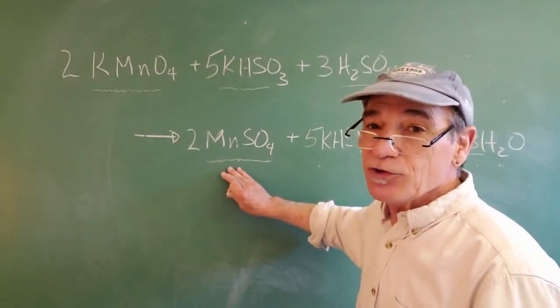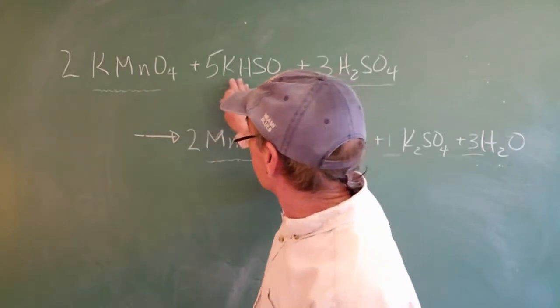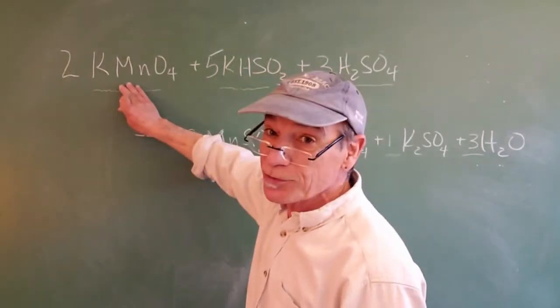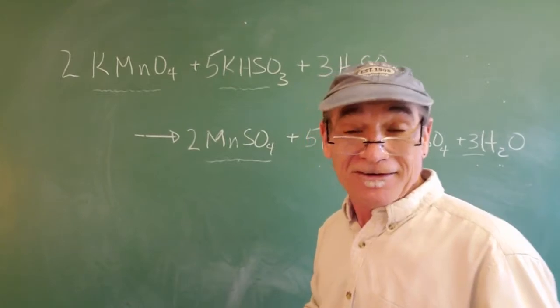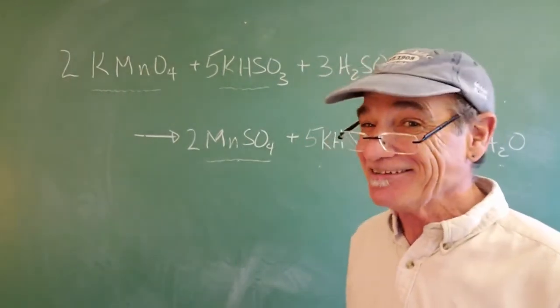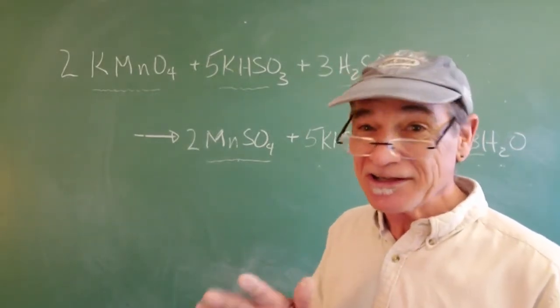So the minute you reach the endpoint of this titration, where we dribble potassium hydrogen sulfite into a solution of potassium permanganate, suddenly the purple color completely vanishes. We chose this because no indicator is required, it's a nice easy titration, with a very clear distinct endpoint to hit.